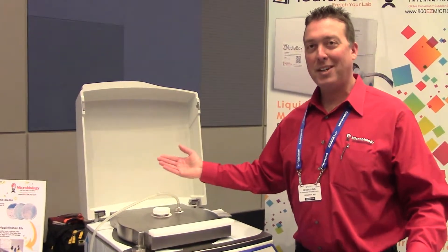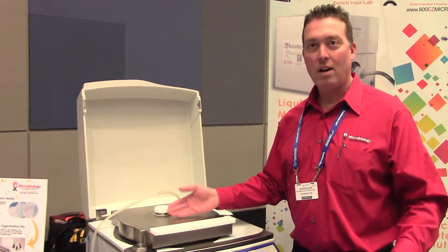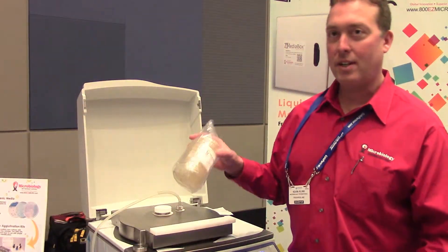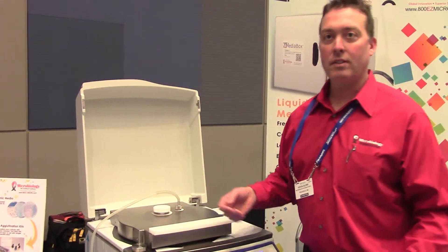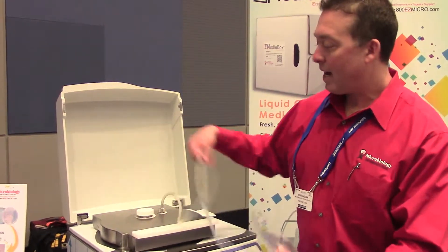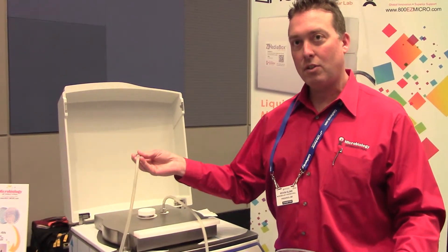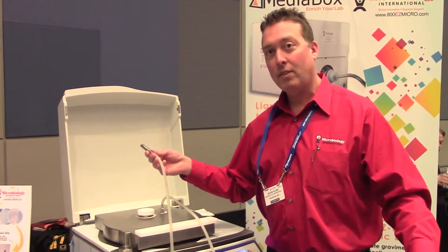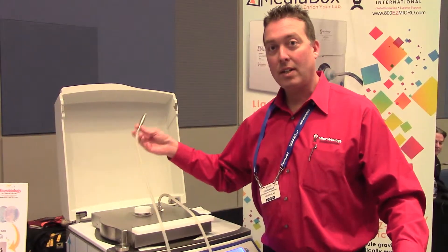We simply allow the media to solubilize. Just like a bread maker, we're going to come back in an hour and we're going to have sterile liquid media — either molten agar for pouring plates, so you can actually prepare your petri plates yourself, or we can prepare broths for pre-enrichment, even sterile water. And we're going to pump the media out using peristalsis or pressure into the vessel of your choice. It's a very simple process, very efficient. It makes making media cost-effective, reproducible, and saves your lab a lot of time and money.